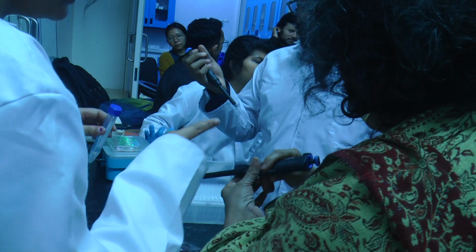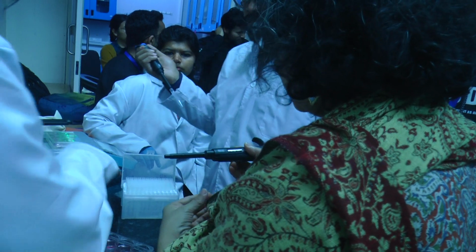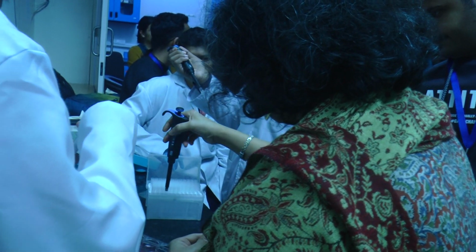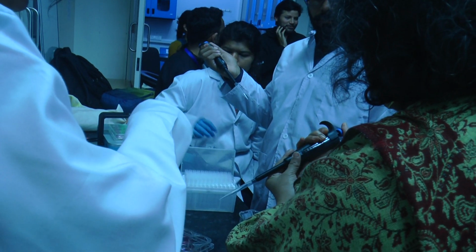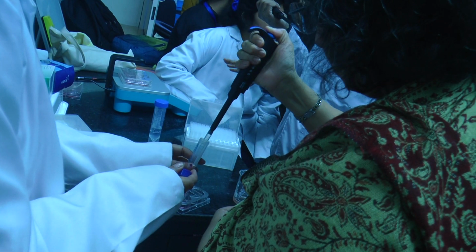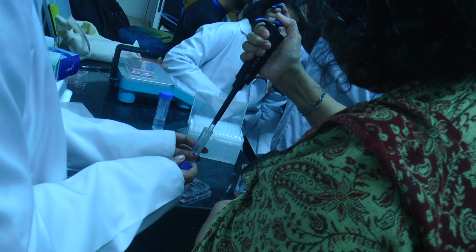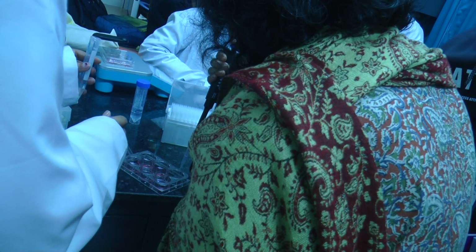I have to use this. I am adding it because this is a small part, so my 100 microliters is enough. Okay. So you can use it, take it. And this. So again, I press it. It's done. Yeah. You can spread it all around slowly.